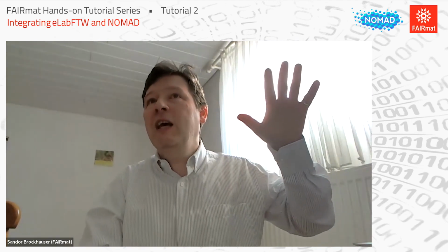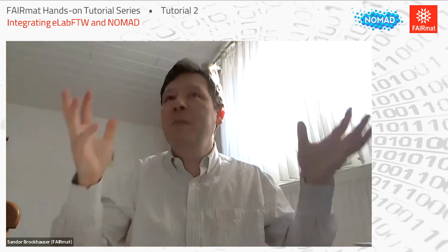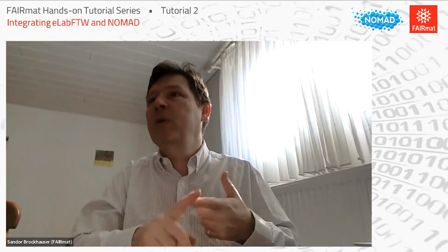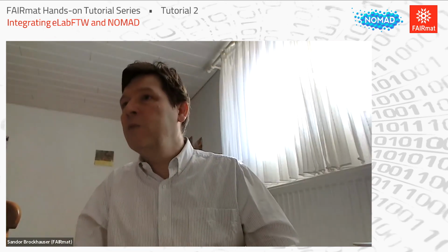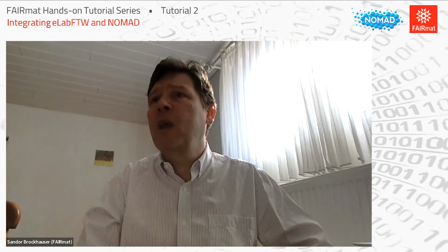And that's what NOMAD also provides on the other end, that all your machine interpretable data is managed together. It's searchable, filterable, and so on. So we are ready for new questions. You can have questions also for Pepe.